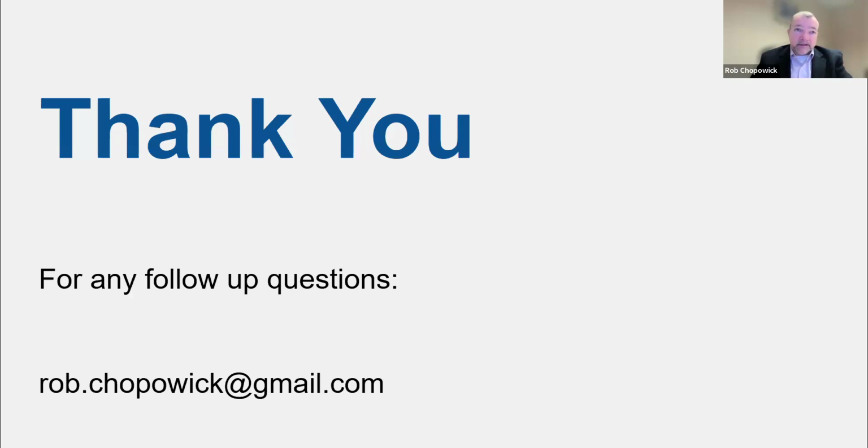That being said, I've been involved in many tracer gas projects where putting dynamic challenges in place, whether it's fans, walk-bys, or opening and closing doors, or adjusting room conditions in other ways. It's an emerging thing. And so that's why I've included it in my four emerging methods. I think it's important, and I think you'll see more of it. And it's just a matter of coming to terms with a standard way, because right now there's a little variation in how you do the robustness tests.